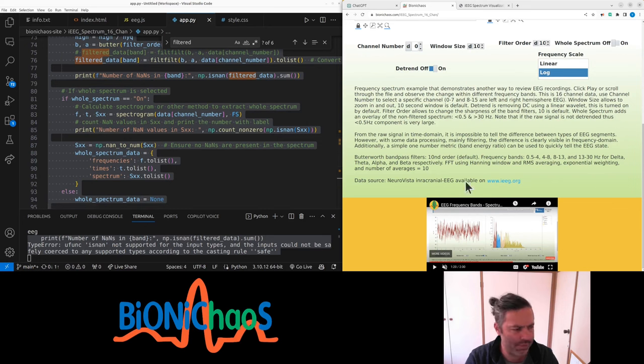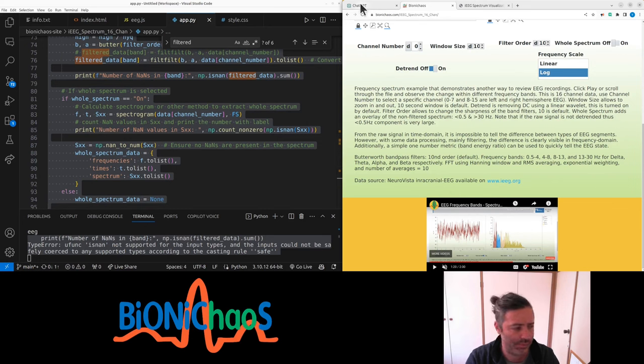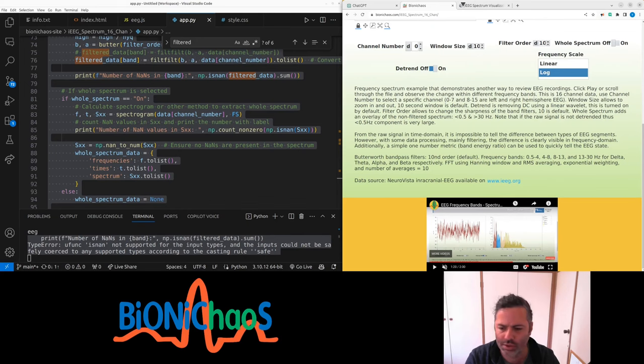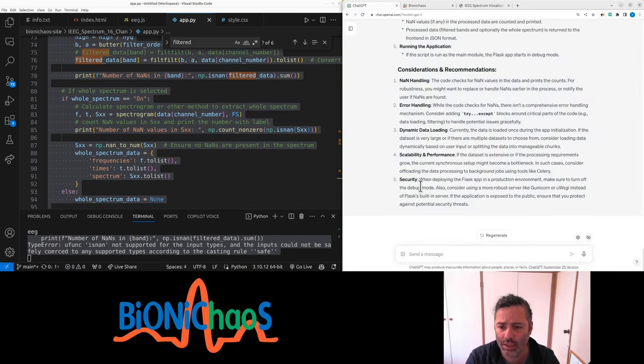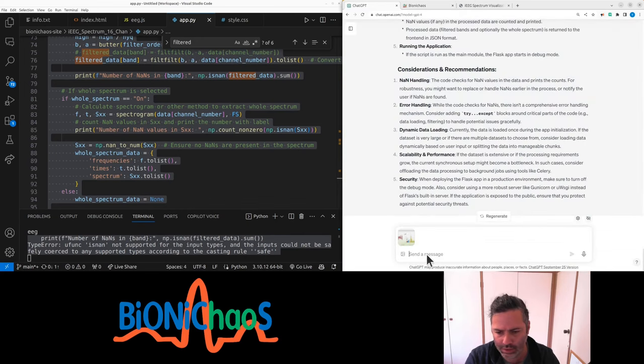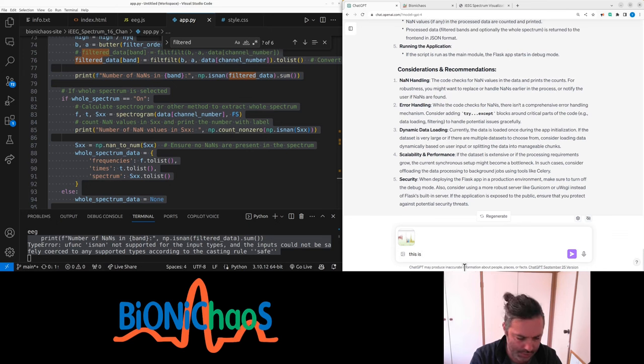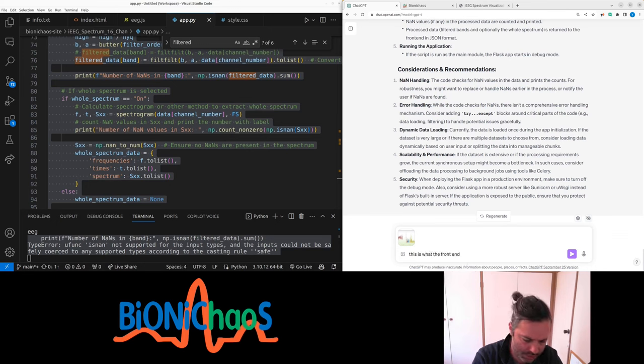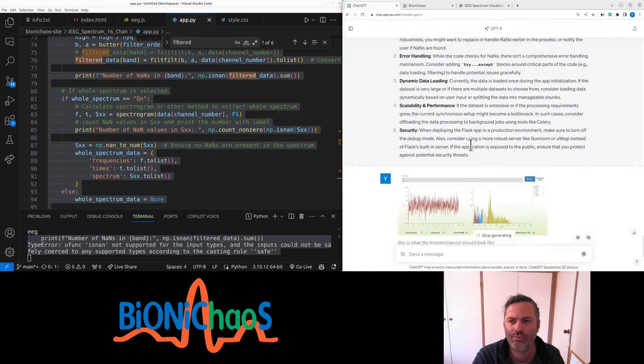I can just save this as an image. Just trying to get an image for the interface because we could actually feed it into the model. So it should look like this and this is what the front end should look like.